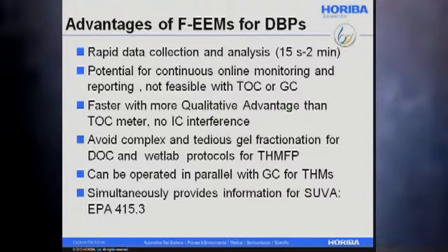In terms of TOC, there are a number of compounds that generally are summed together, so you don't actually have a qualitative identification of the individual species. And in the case of the fluorescence, there's no room for inorganic carbon interference.